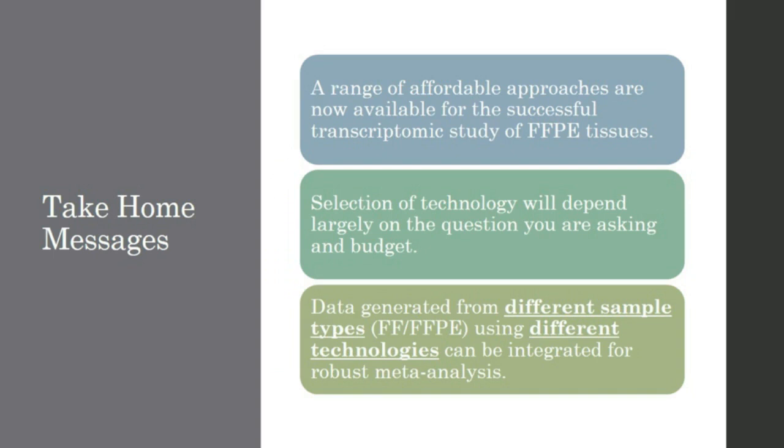So I suppose my take-home messages, and as I said before, this wasn't a fully comprehensive study. This is more sharing the experiences of a translational lab with these technologies. We have a range of affordable approaches which are now available for the successful transcriptomic study of FFPE tissues. I think, importantly, the selection of technology will depend largely on the question that you're asking and the budget. And another thing that I think we've demonstrated is that data generated from either fresh frozen or FFPE tissues using different technologies can be reliably integrated for robust meta-analysis, given the caveats that I've already mentioned.